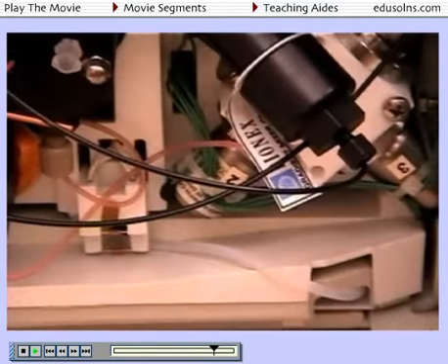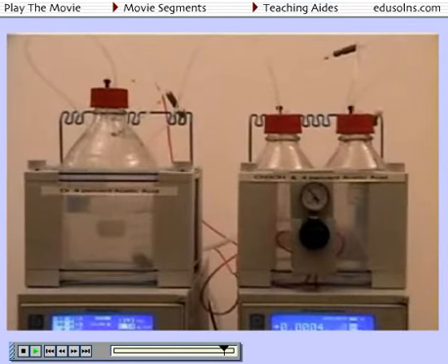When you are finished priming the pump, set the flow rate to the desired flow rate for the analytical method. The system should be allowed to stabilize with respect to solvent composition for about 20 minutes prior to use. This will also allow the detector to warm up and stabilize.